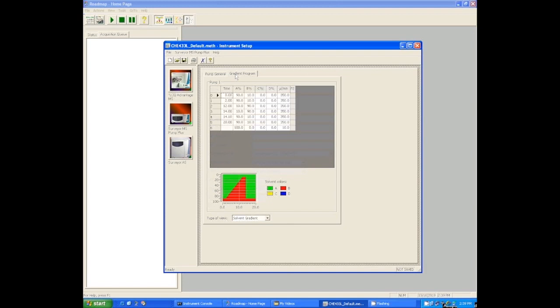So one nice thing about this software is if you look at that green and red on the bottom, that is a graphical depiction of your gradient over time. So you can see in that graph that we start at mostly A with a little bit of B and we gradually ramp up to a lot of B, a lot of the organic, and then we hold there and then we drop back down for the equilibration. So that graph is a helpful way to double check that you've programmed things right.